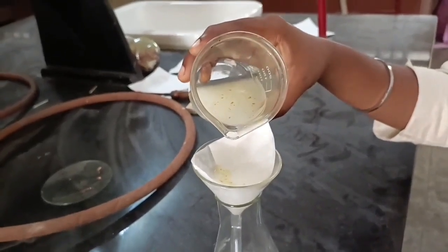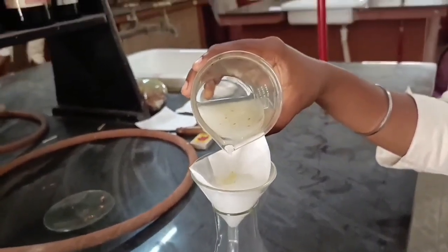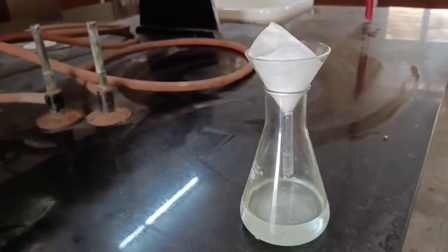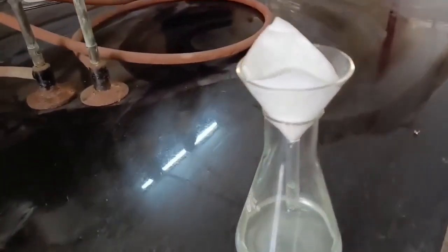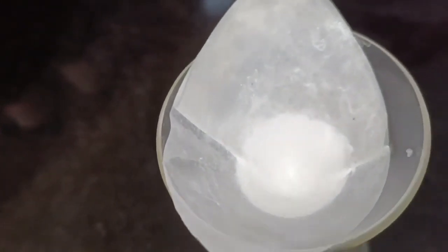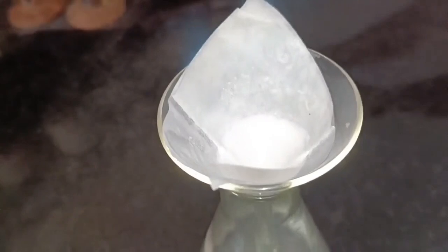Next, filter this precipitate through filter paper using a funnel. After filtration, you can observe the formation of white colored cuprous chloride. This must be dried, and then you can record the yield in your report.